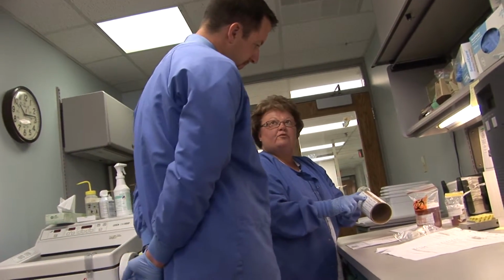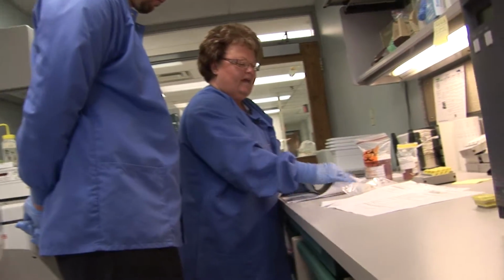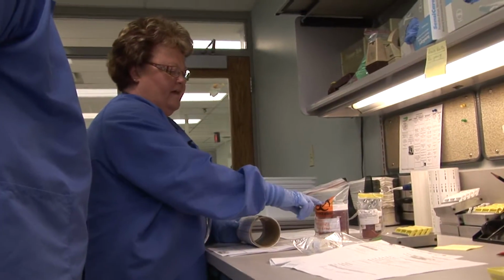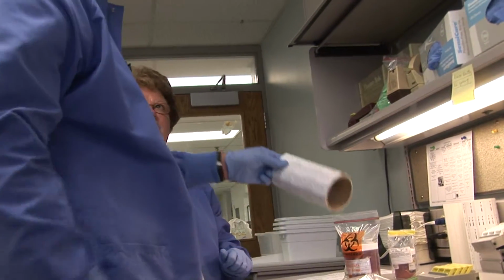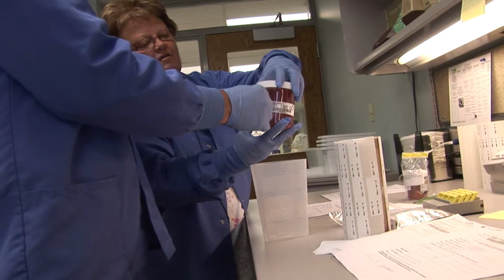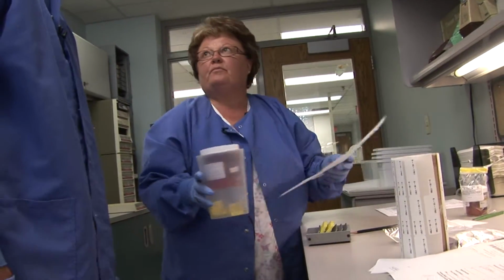this is our next number that's in line, and you need to put it on this requisition and also on the second sheet. And then I'm going to have you open this up and we'll put it on here as well. Okay. Anywhere? Go ahead, anywhere. All right, so this is ready to go into the gross room for the pathologist. So we'll take this in here.